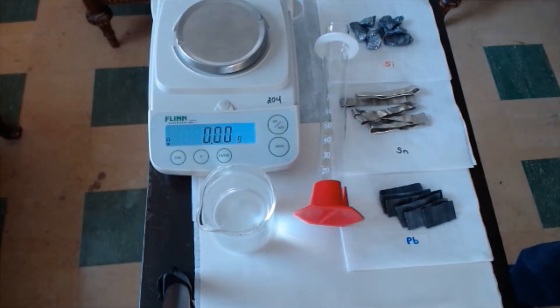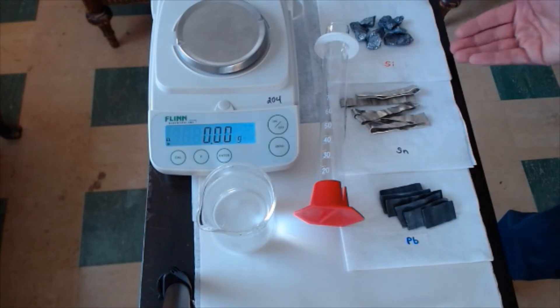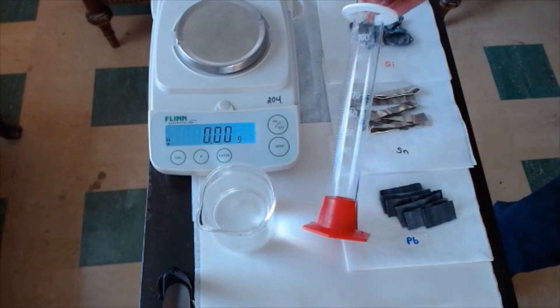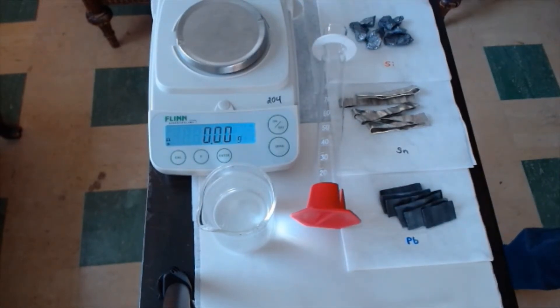Make sure we have everything assembled that we need. We need the samples of our elements. We have silicon, we have some pieces of tin, and we have some pieces of lead. We have a graduated cylinder and we have our electronic balance.